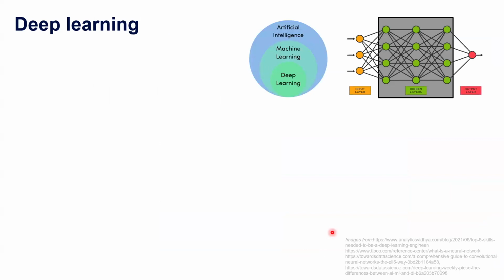Another automated approach to object segmentation is called deep learning. For those of you who are not really familiar with deep learning, let me give you a high-level overview. Deep learning is a subset of machine learning, and it's the one that usually deals with artificial neural networks. So what is an artificial neural network? As the name suggests, it's modeled after the way neurons work in the brain.